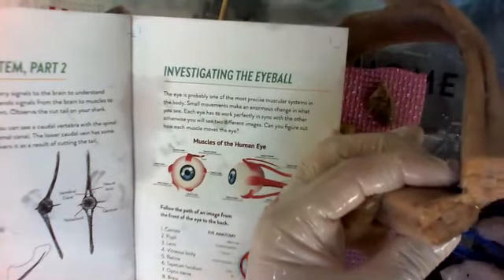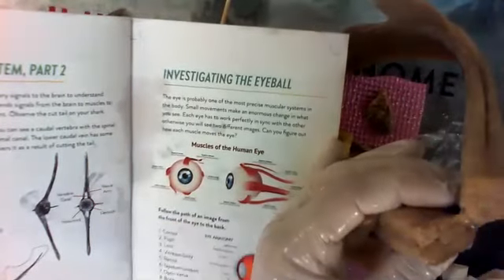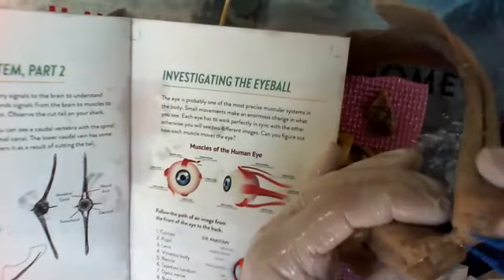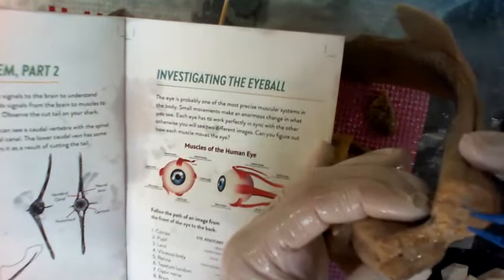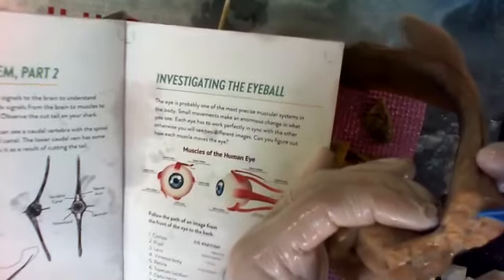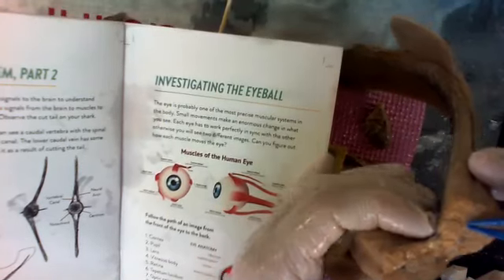But you'll notice, hopefully, there's a vertebra. And this, depending on what part of the body, it'll have the fins on it or not. But it'll always have three things. Here you have the actual body itself, this round thing. The body grows. A shark never stops growing. So if you slice this, put it under a microscope, count how many rings deep it is, it tells you how old the shark is. I'm not kidding, like a tree.